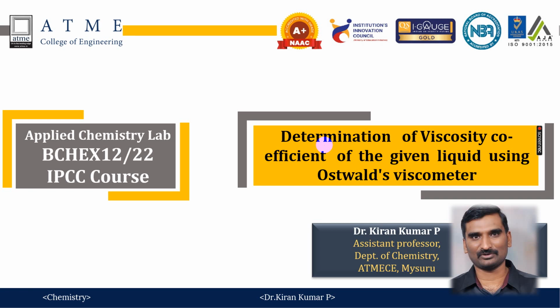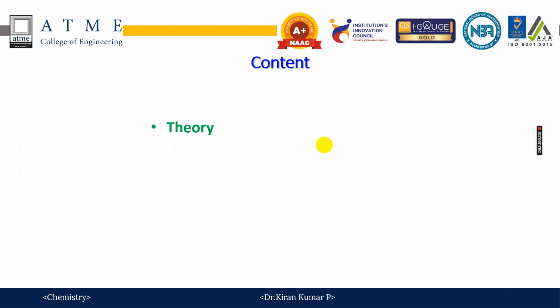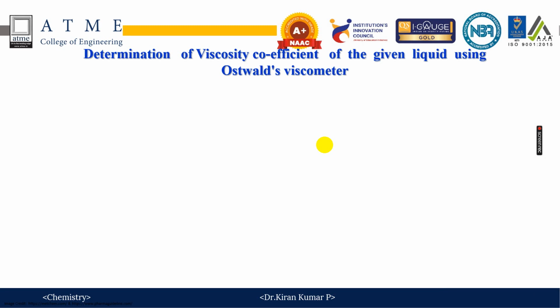Today's experiment is on the determination of viscosity coefficient of the given liquid using Ostwald viscometer. So the entire session includes the theory, experimental demonstration, and observation and calculations. Determination of viscosity coefficient of a given lubricant or a liquid using Ostwald viscometer.